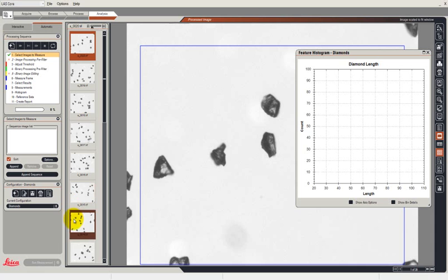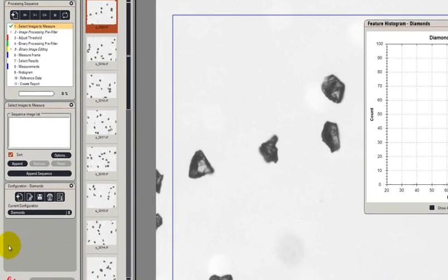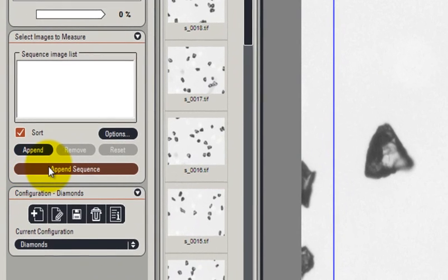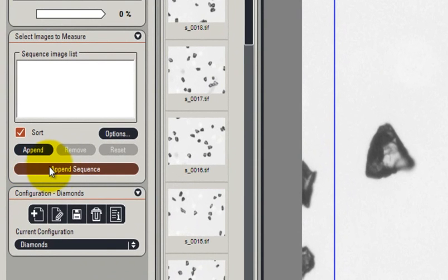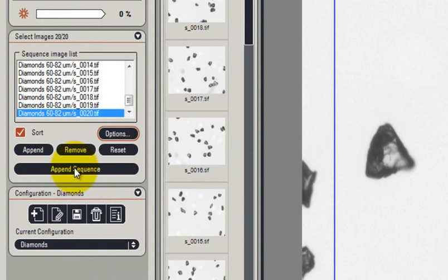So first of all let's select the images. All I have to do is to collect the append sequence button because, as I mentioned, these are images collected as a multi-step sequence. So it allows me to select all the images with one button click.